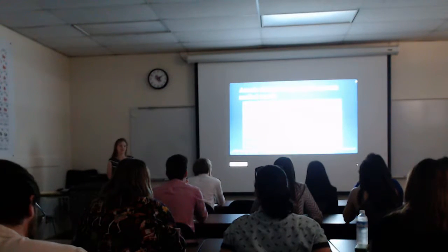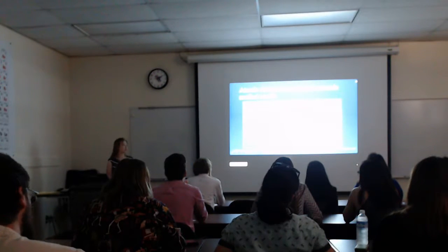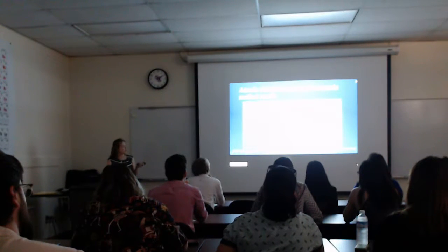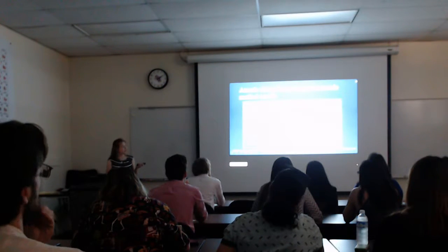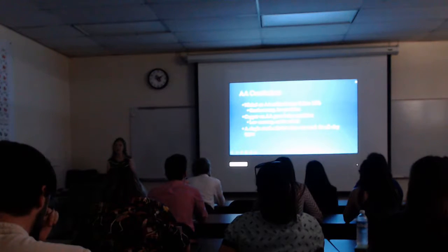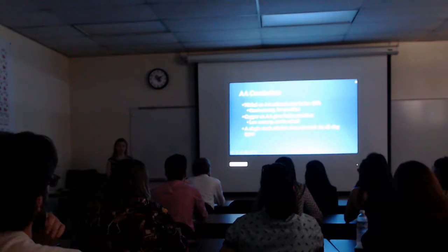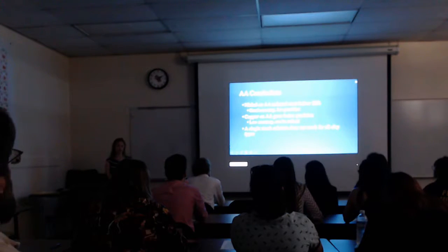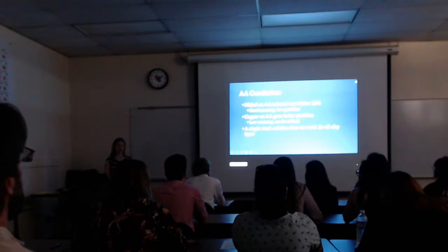So we looked at its standard deviation because maybe if it's that accurate, it will be that precise. This was not true. We had some that were relatively precise, but when we went over to the nickel, which showed greater accuracy, we lost our precision. So what we were able to conclude from the AA was that the nickel was able to reduce the error below 20%. It had really good accuracy, but not so great precision. The copper had better precision, but much lower accuracy.